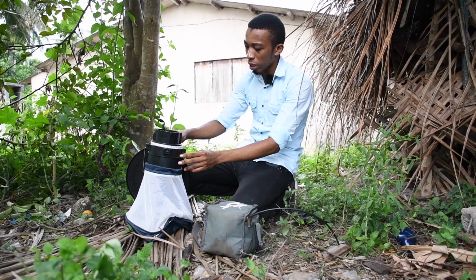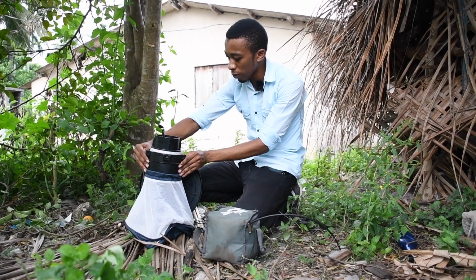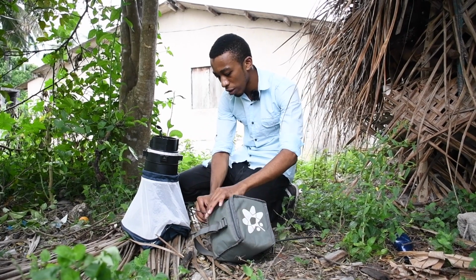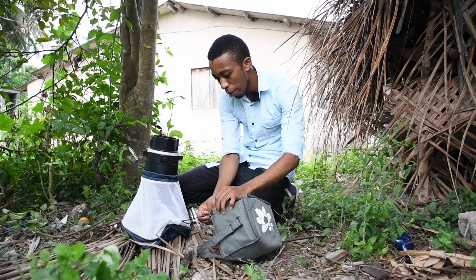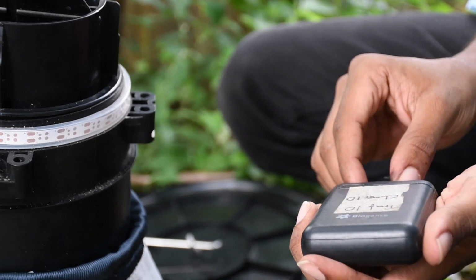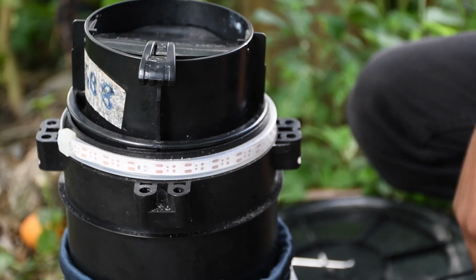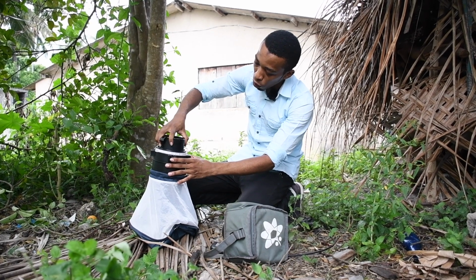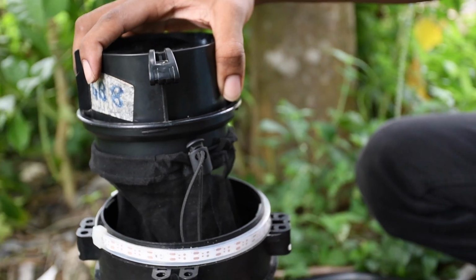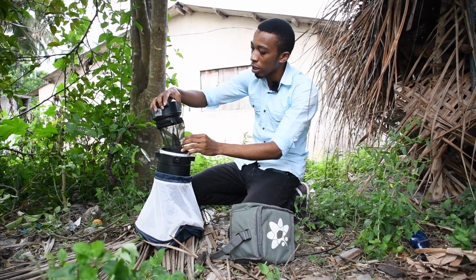So once we've unhooked the trap from its original position, we remove the rain shield and the handle. Okay, and then we detach the terminals from the battery or the power bank, making sure that the trap door closes itself. Okay, so once the trap door closes itself, we release or unhook the head of the trap, which is connected to the net inside, and then we ease the grip a bit, not too much, to make sure that the mosquitoes do not escape.